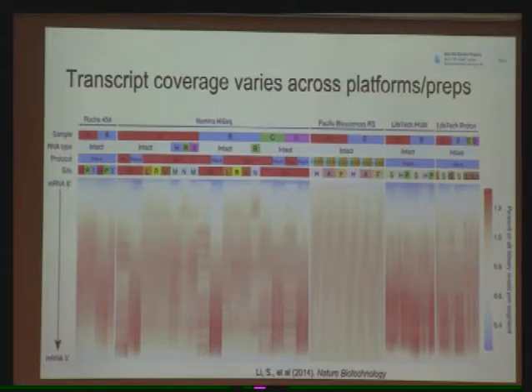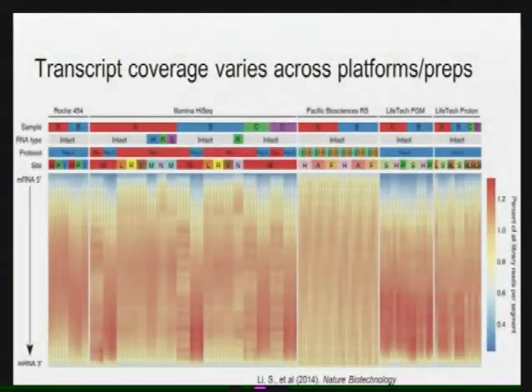The full transcript, I think, is attached to a pore, and the polymerase is attached to the pore, and as the RNA is moving through it, you basically get a different fluorescence. Is that for the PacBio? I thought that was Ion. It might be, yeah. PacBio is something about the enzyme moving along.